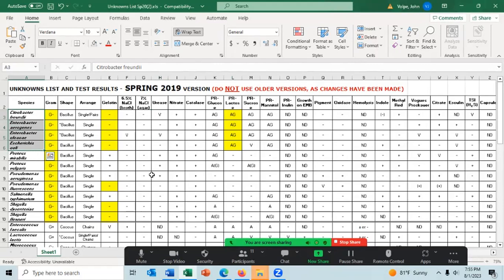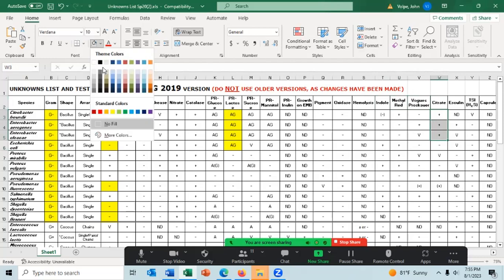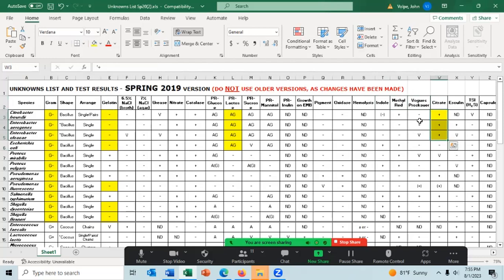And you could pick this test, methyl red, or Voges-Proskauer, or the Simmons citrate test. And if you pick the Simmons citrate test and the result comes back positive, you've narrowed it down to these 3. And that's what you do.